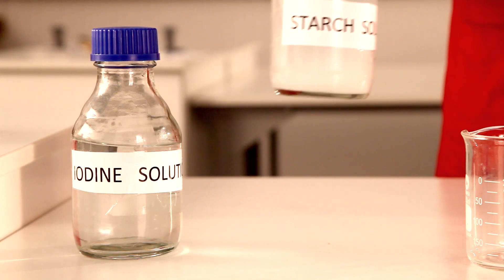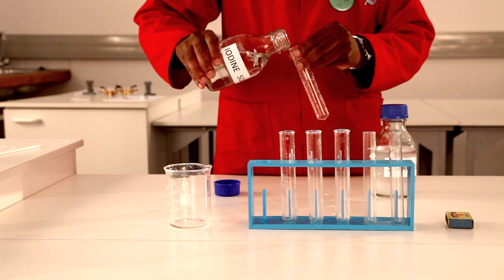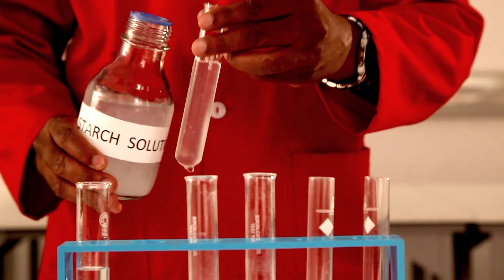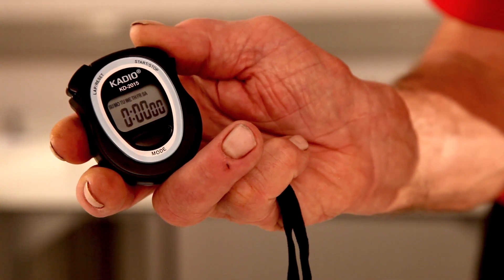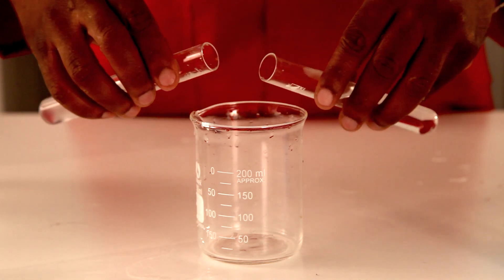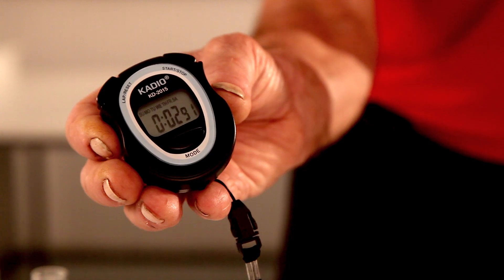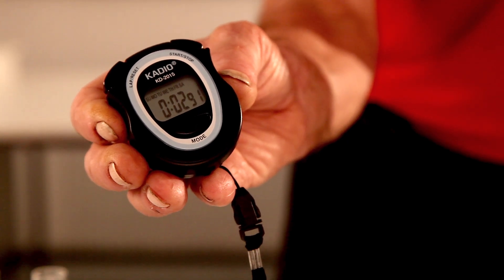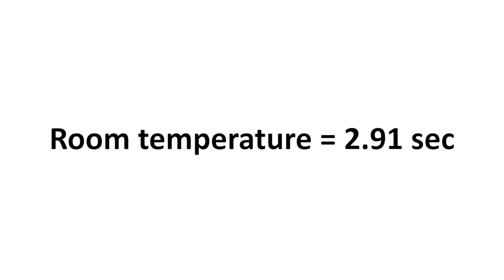Pour 10 cm³ of iodine solution and starch solution at room temperature into separate test tubes. Before pouring the contents of the test tubes, make sure the stopwatch is at zero. Pour the contents of both test tubes into a 250 cm³ beaker. Measure the time of the reaction with a stopwatch. The reaction time was 2.9 seconds.